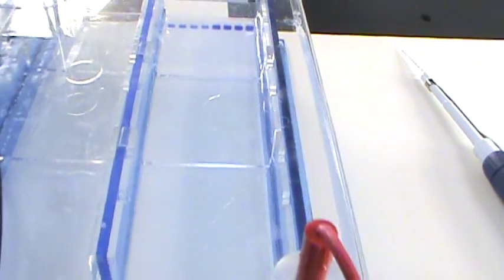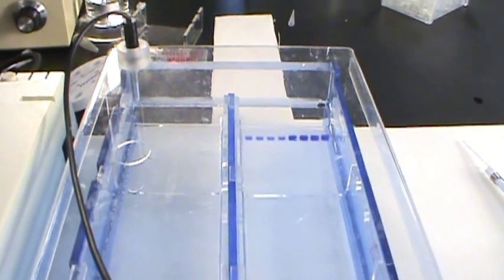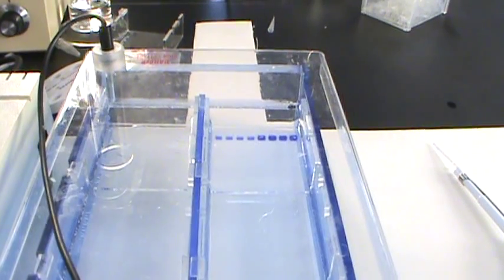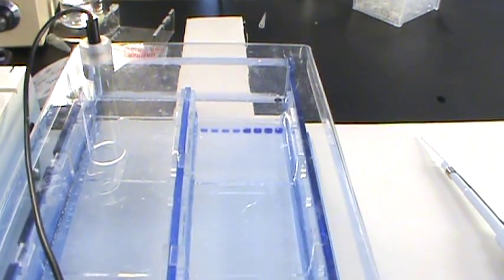The other thing that you should notice if you have everything hooked up correctly is that when you look at your electrophoresis unit, you should see bubbles in the system. There will be bubbles at each of the electrodes. What's happening is we're putting electricity through the buffer, which is mostly water, and so we are getting electrolysis of that water. Those bands should then migrate from their wells and move down toward the opposite end of the gel. If you see that they are moving in the opposite direction, you have the system set up incorrectly. And stop it before you lose your sample.